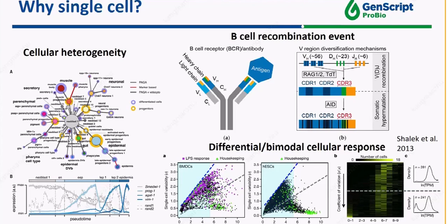So why do we need to access cellular information at the single cell level rather than looking at the average characterization over a cell population? The short answer is that no two cells are alike. Recent advances in cellular profiling have demonstrated substantial heterogeneity in cells that were once deemed identical. Heterogeneity is a critical aspect in understanding cell biology, especially in immunology, oncology, or cell differentiation.